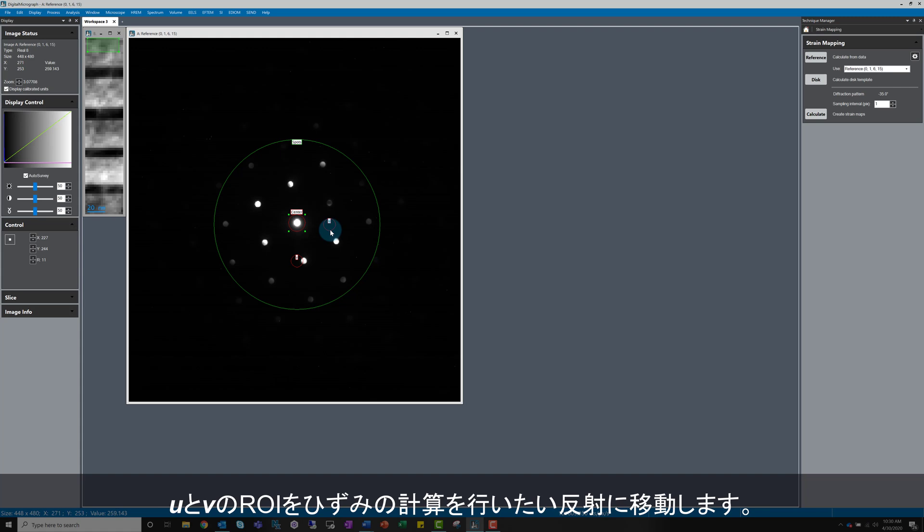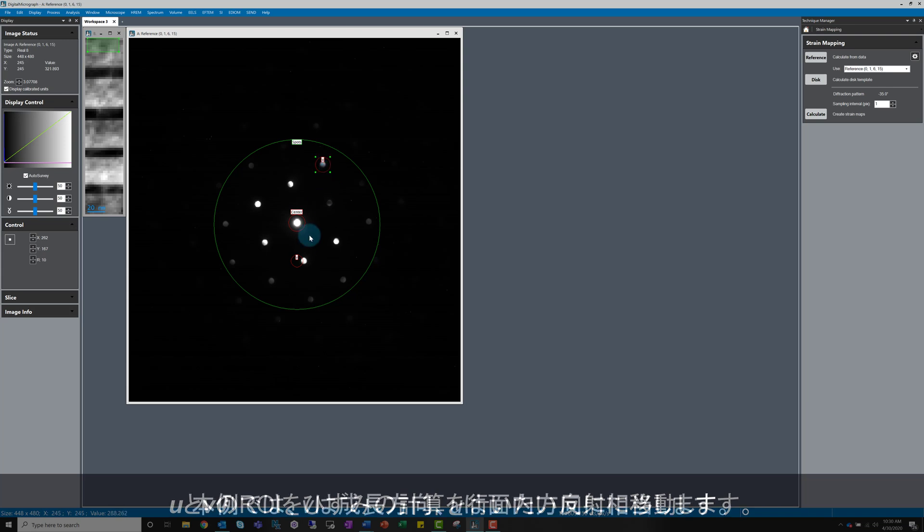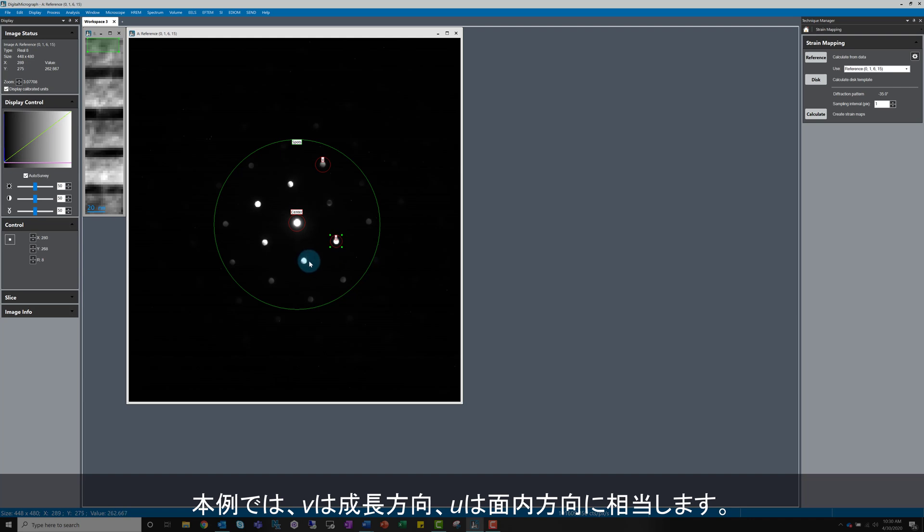Now move the U and V circles onto the reflections which correspond to directions in which you want to calculate the strain. In this example, I'm selecting V as the growth direction and making U the in-plane direction.